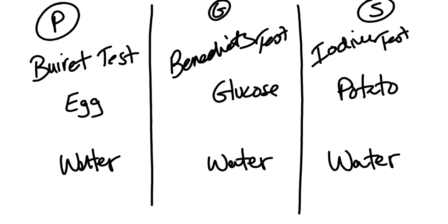The amounts and the exact procedure that we're going to do in class, I will talk about before we get there. This is just a background video, so you know what we're testing, how we're testing it, and what our positive controls are going to look like.